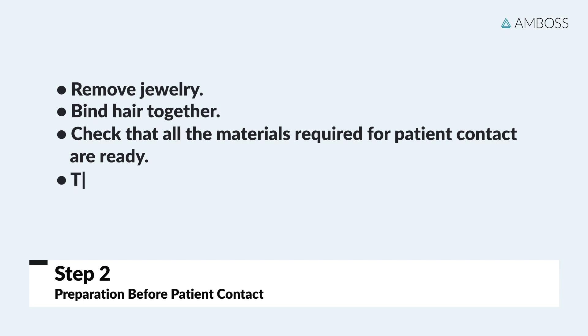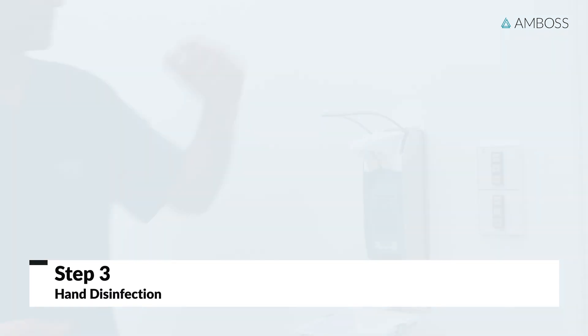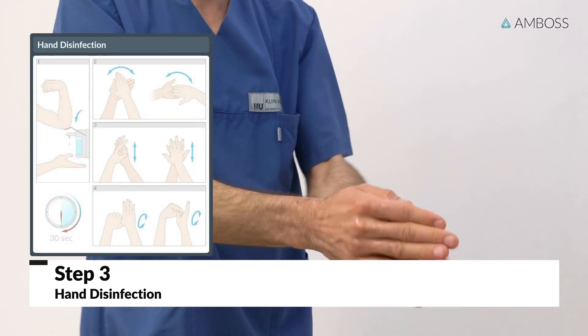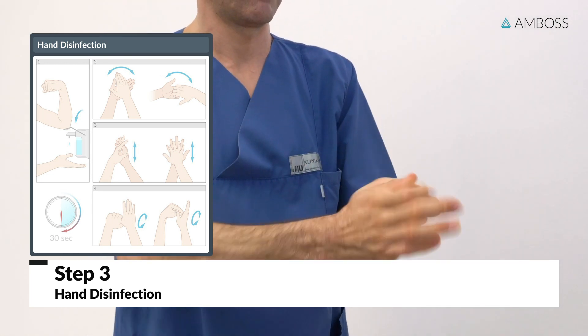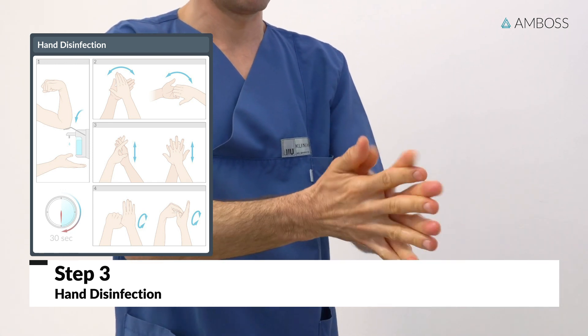One last tip: it can get warm quickly under protective clothing, so make sure you have drunk enough fluids before putting on protective clothing. The next step is hand disinfection. Collect two to three pumps of disinfectant from a dispenser and thoroughly rub the liquid into both dry hands. Take care not to leave out the fingertips, gaps between the fingers, or wrists. A thorough hand disinfection takes about 30 seconds.